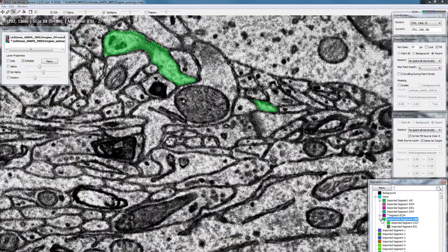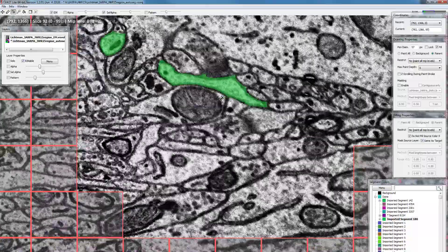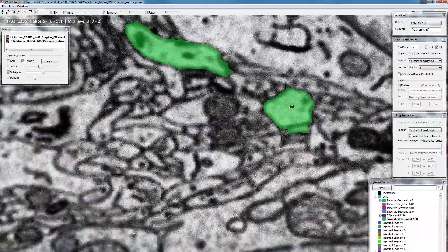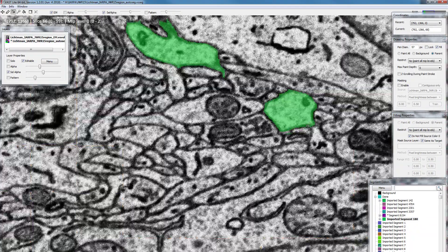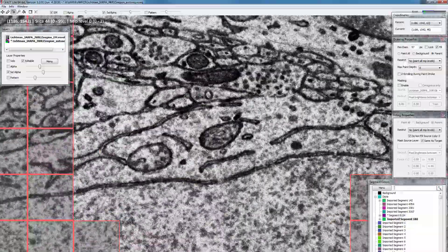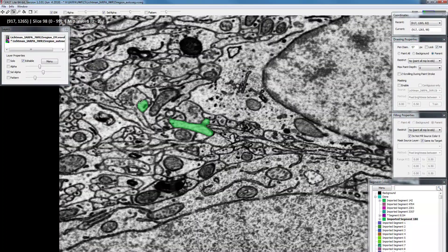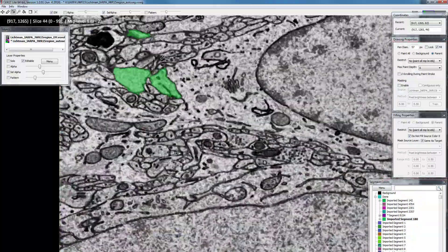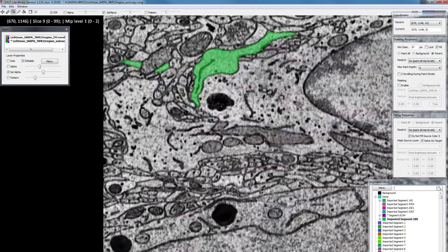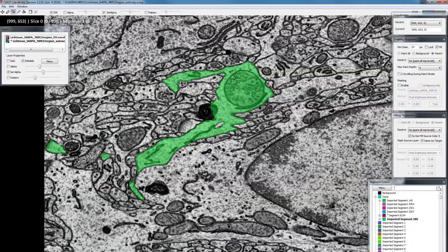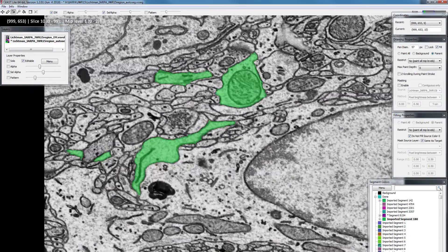Let's go back to the object we were working on. I fixed this spine merger, and there is another split here. That's the end of this dendrite — that is a dendritic spine, and this dendritic spine actually continues here and it's also not part of the object but it should be, so I'm collecting it. There's a little bit of a problem here, maybe we should split that off too, but I'll forget about that for now. Then it continues here so that should also be part of it — I collect that. Here's another spine that needs to be part of it. I collect that too.